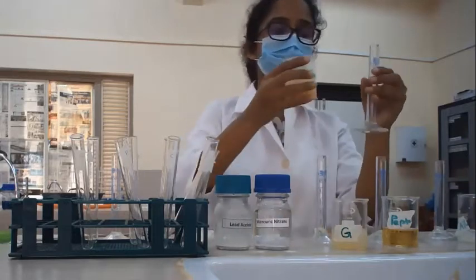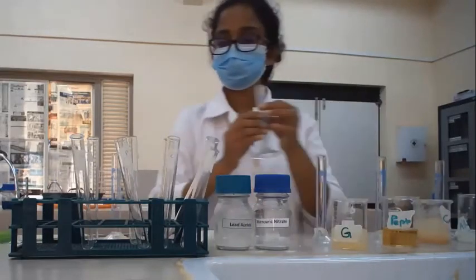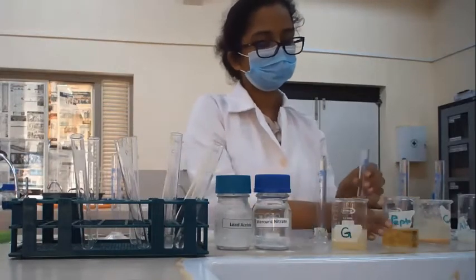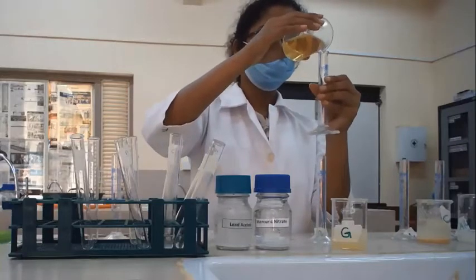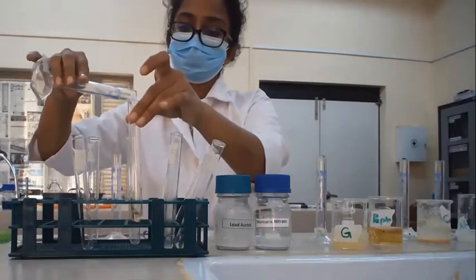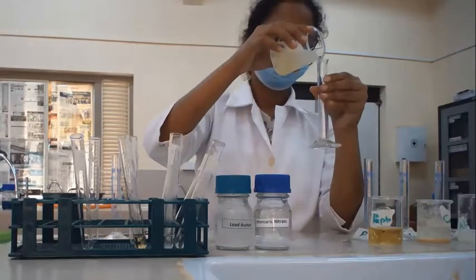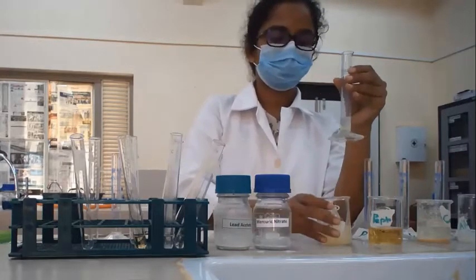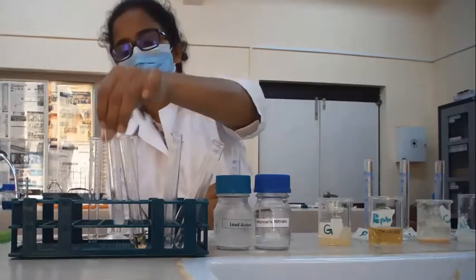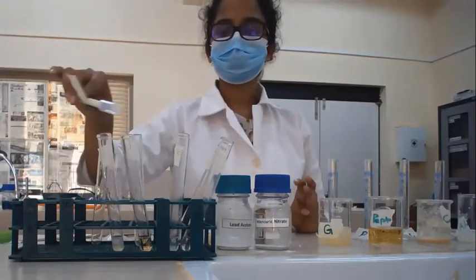Now I am taking from the casein. Next, 3 milliliters from the peptone. And finally, from the gelatin. Next, I'm going to add a few drops of mercuric nitrate to each of the samples.